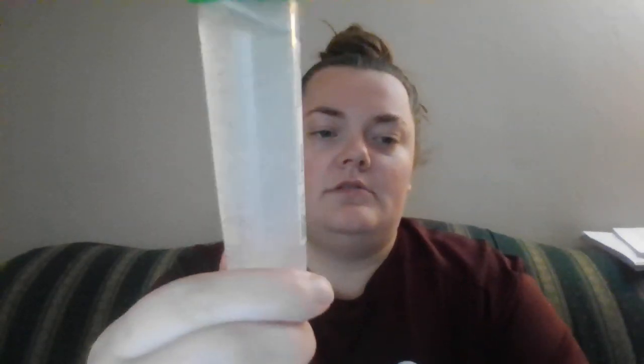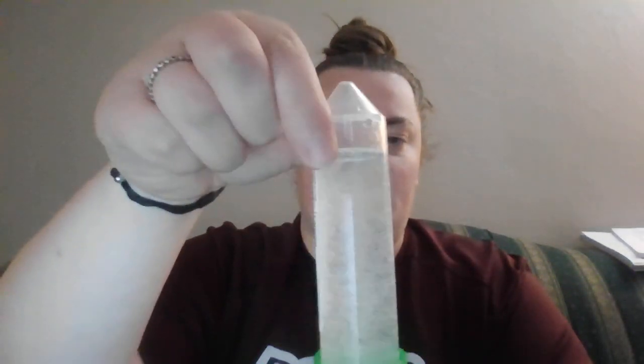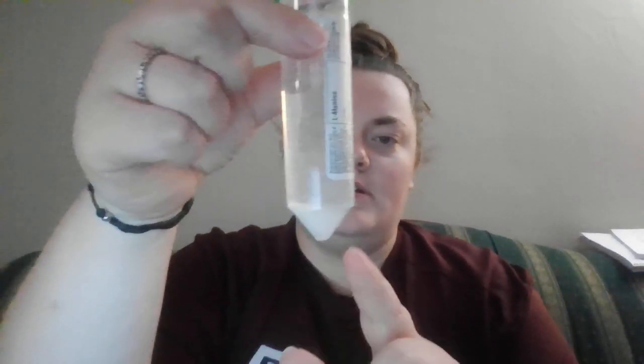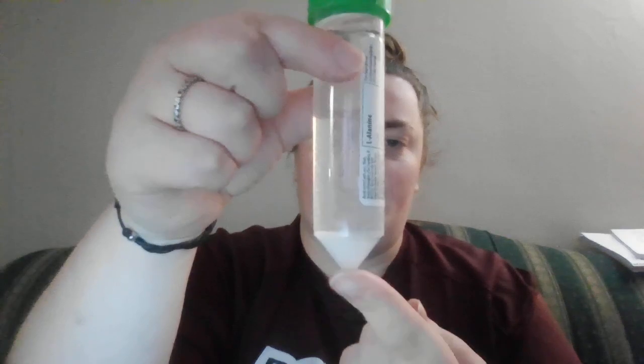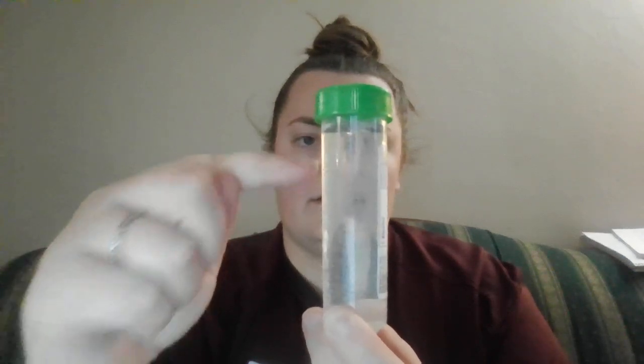These impurities will block light and will change your experiment if they're allowed to be within your solution. So for this experiment, we had to wait and make sure that all of these particles settled, and then made sure to use just the liquid and keep all of these solids that are starting to settle in the bottom here within this centrifuge tube. That way, we can look through and let the light pass through this space here that is much clearer.